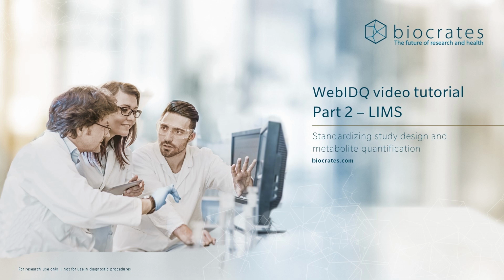In this section, we'll go over the LIMS module and how to create and register projects in WebIDQ. LIMS is the Laboratory Information Management System module for WebIDQ. It's the starting point for each assay and responsible for registering samples, creating projects and submissions, and finally arranging samples into work lists for LC-MS analysis.